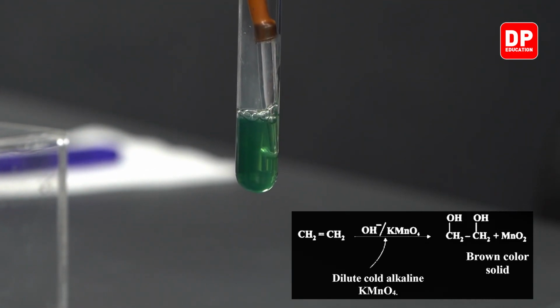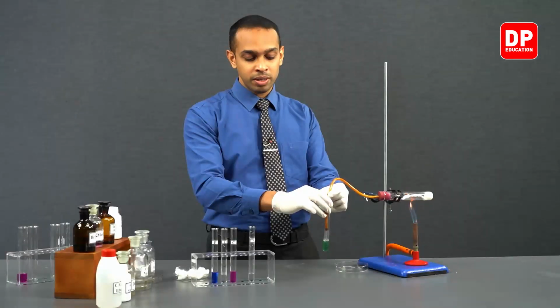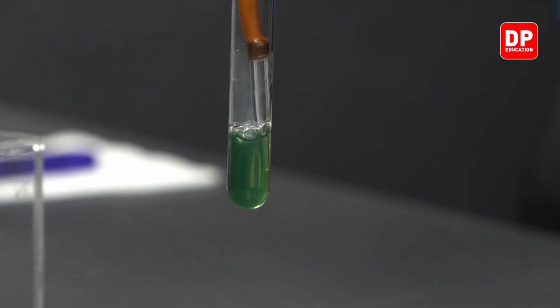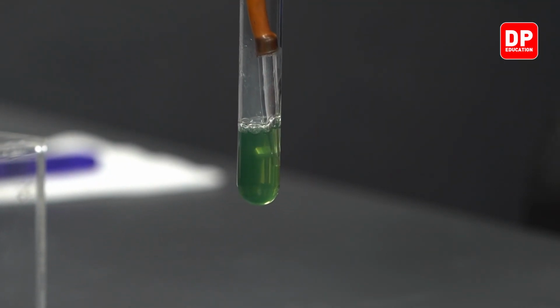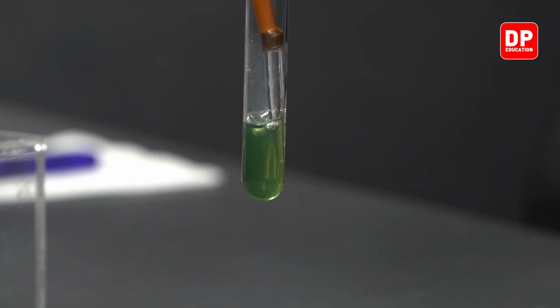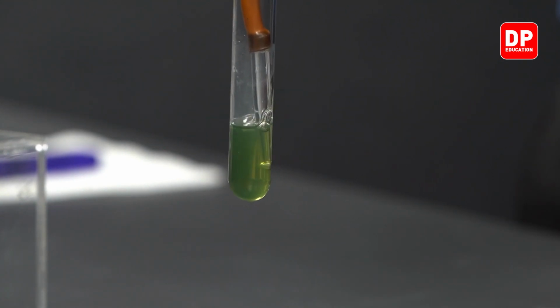Do you see the green color disappearing little by little? The green color is disappearing to form a brown color. This is because of the formation of MnO2, manganese dioxide. Manganese dioxide is a water insoluble precipitate.